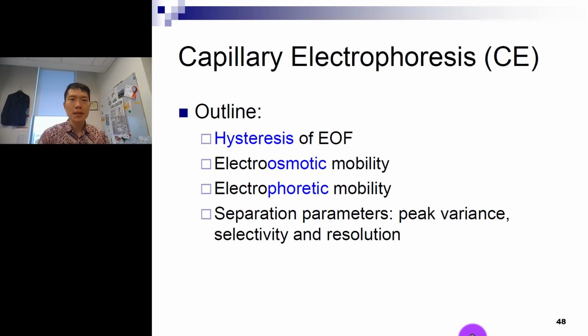Okay, next we talk about the next part of CE, the hysteresis of EOF, something about electroosmotic mobility and electrophoretic mobility, and lastly the parameters of separations: your peak variance, selectivity, and your resolution.